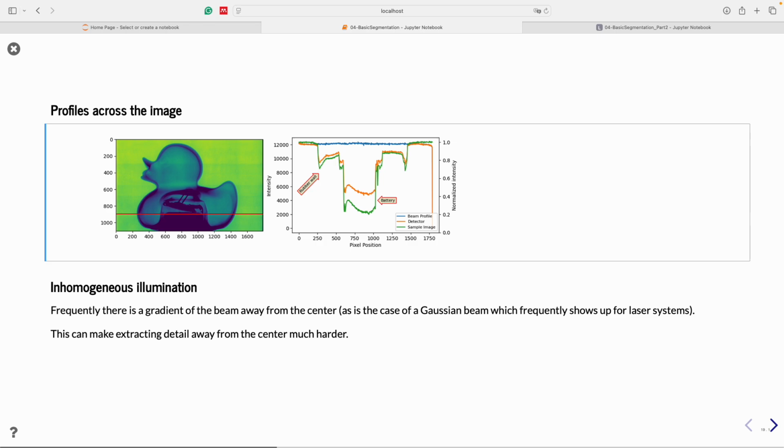What can happen if you don't normalize correctly is that you can have inhomogeneous illumination. And looking at this plot, I just took a profile about at this height. And then you can see here, this corresponds to the wall, this one too. This would be the area of the battery. And you can see that there is a deviation here. And the true image should have a transmission of 1 out in the void, and then it's getting less if you go inside a sample. But there are different effects here.